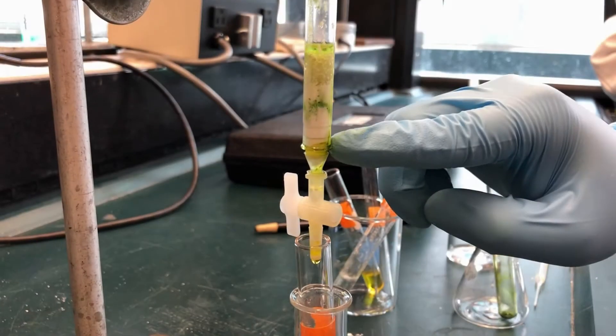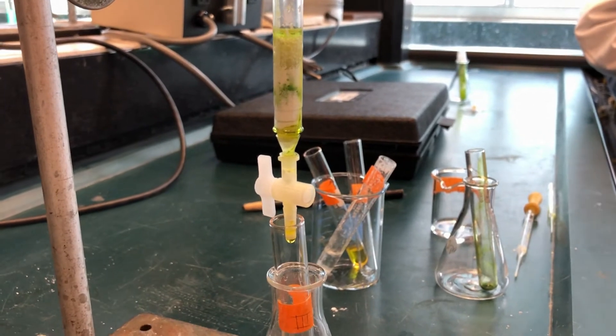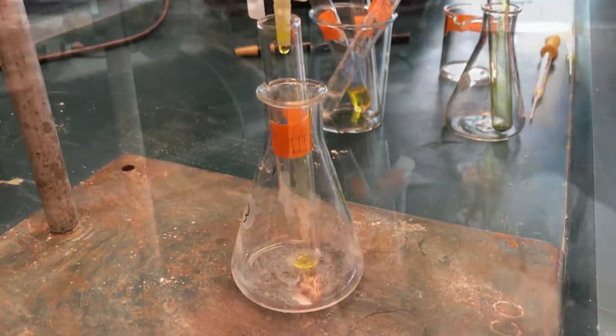Here you can see our green band is moving down. Once the green band is almost at the bottom, switch to test tube 4 to collect the green pigment.